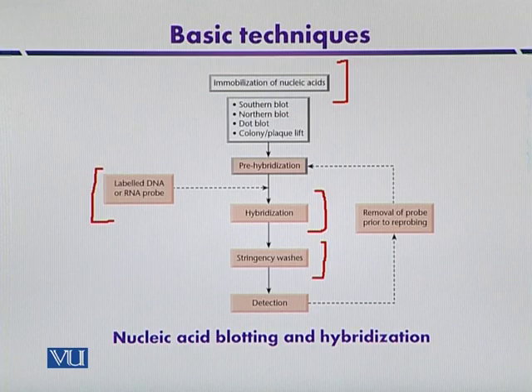For example, if stringency is low, that is if melting temperature is low and ionic strength is high, then at low stringency, partial DNA sequences can also hybridize. But when stringency is high, that means melting temperature is high and ionic strength is low, so that only complementary base pairing occurs. And then after hybridization, the complementation process can be observed by autoradiography.